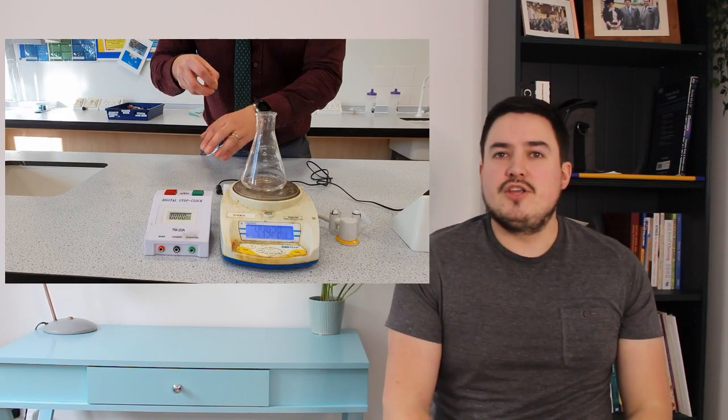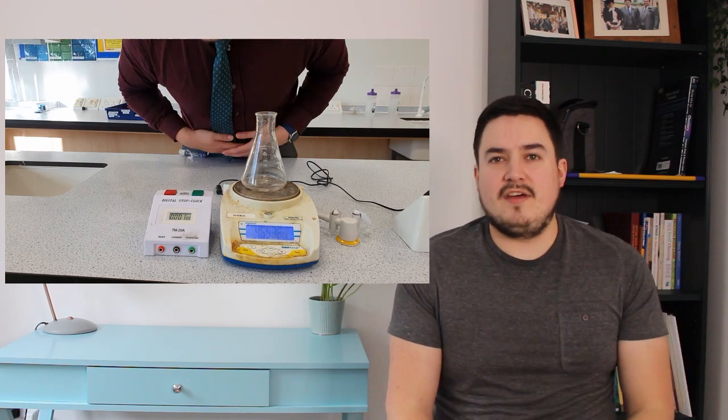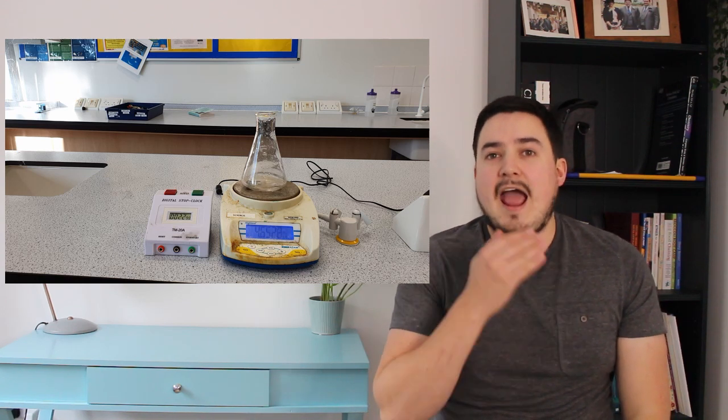In this video, you can clearly see me mixing together the marble chips and hydrochloric acid and starting my timer. Every 10 seconds then, I'd be writing down the mass of this solution, and I'll be able to see how much mass is lost as that time progresses.